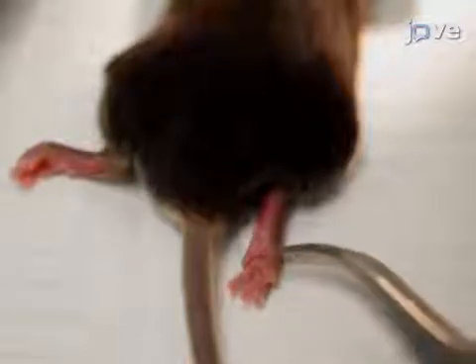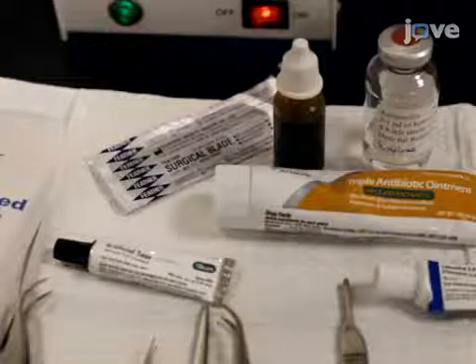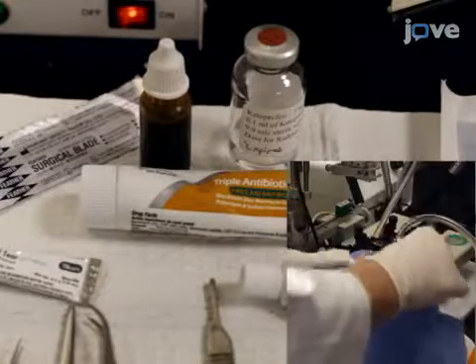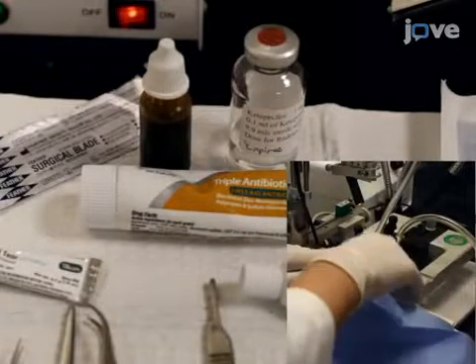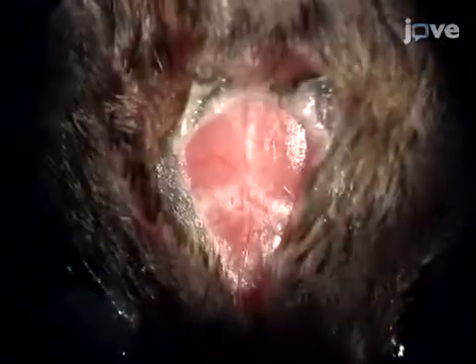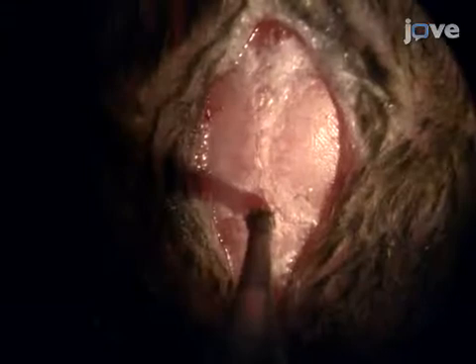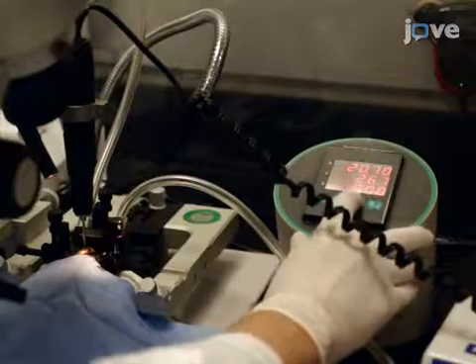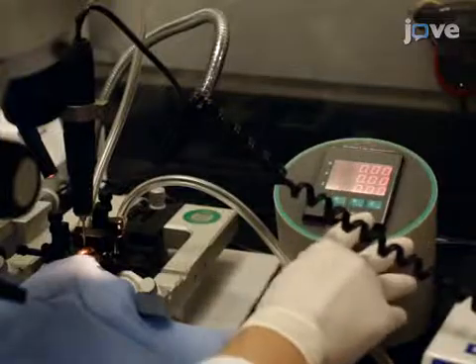Next, confirm the anesthesia by giving a foot pinch. Then apply artificial tears to lubricate the eyes. Subsequently, swab the shaved head with povidone iodine and lidocaine. Now make a small incision along the scalp midline. Dry the skull with a swab and apply hydrogen peroxide to help visualize the bregma. Using a dissecting scope, locate the bregma on the skull and place the drill bit above it. Set the digital stereotactic coordinates of the x, y, and z planes to zero.